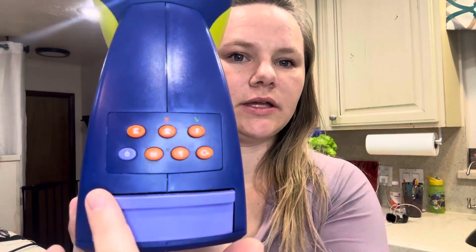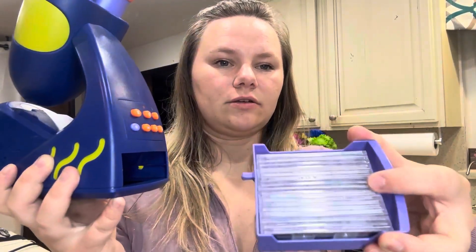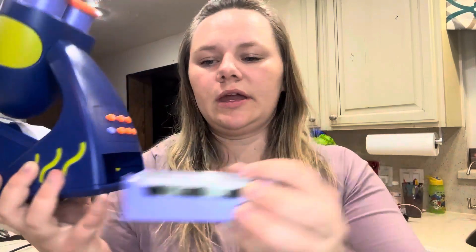On the back it's got multiple different buttons. So you've got power, sound, one, two, three, four. And then you have little vials of things that you can put in.